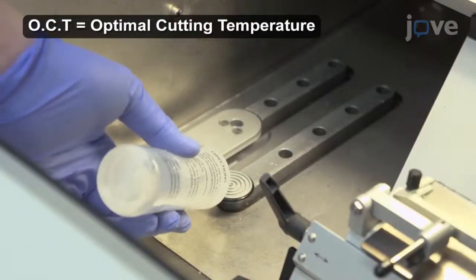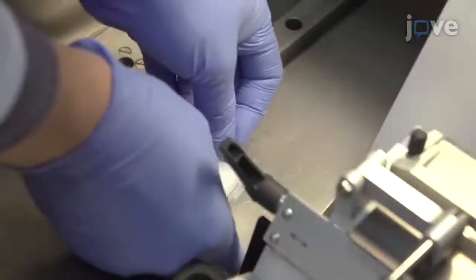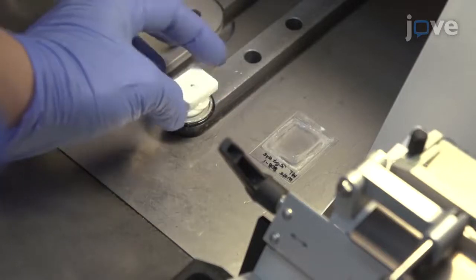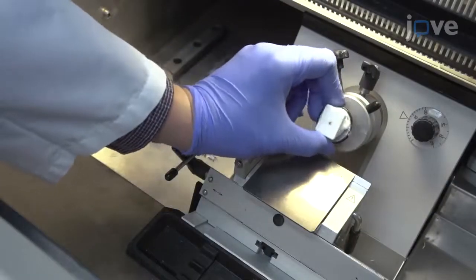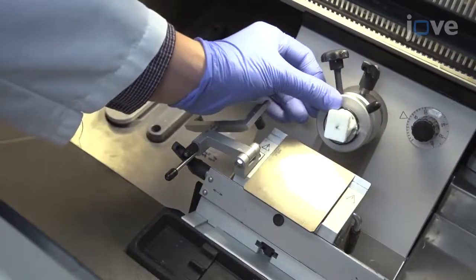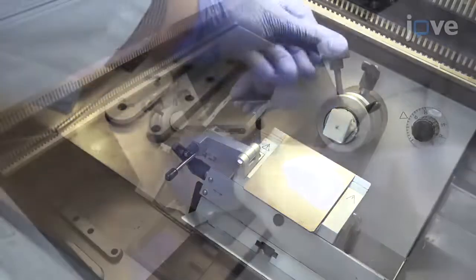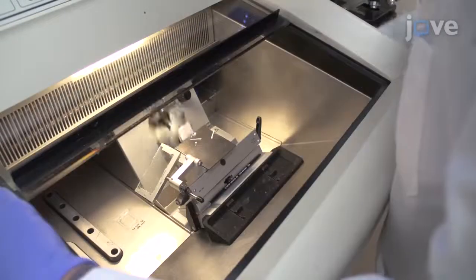Squeeze a small amount of OCT onto the mounting chuck. Then, remove the tissue block from the mold and carefully place the block on the mounting chuck. Once the tissue block on the mounting chuck is frozen solid, insert onto the specimen holder of the cryostat. Next, adjust the cryostat to cut 8-micron sections and carefully section through the OCT block to reach the tissue.